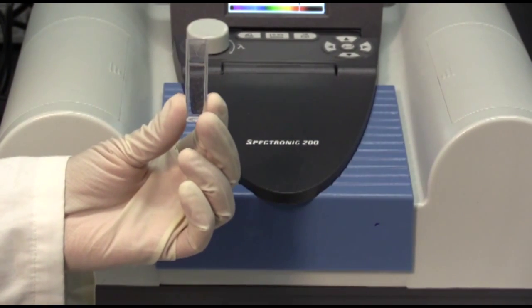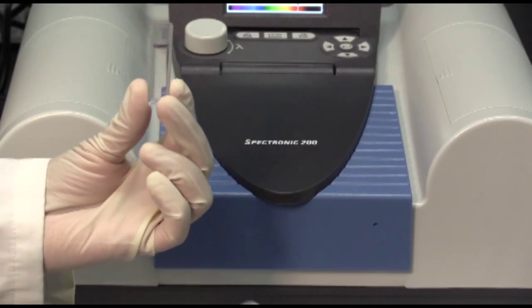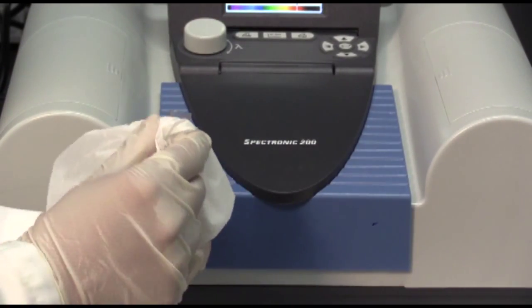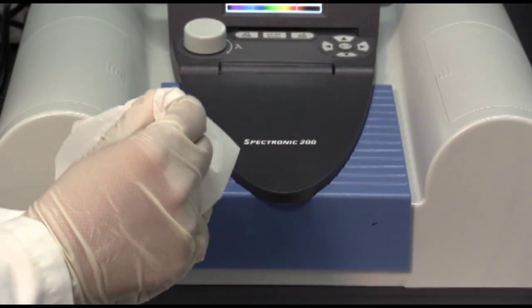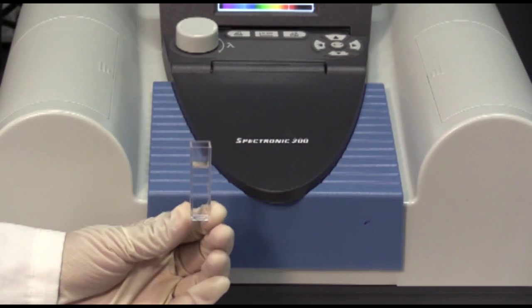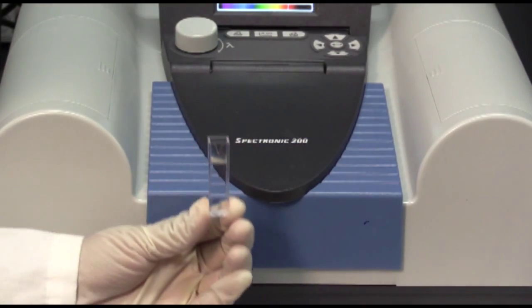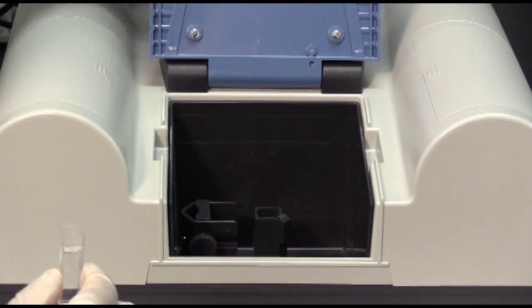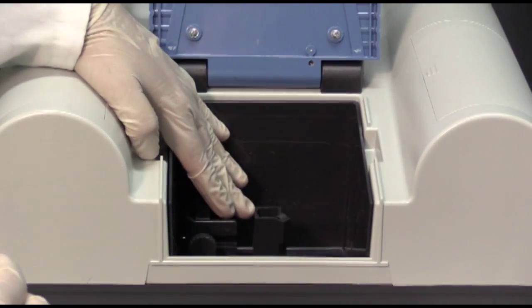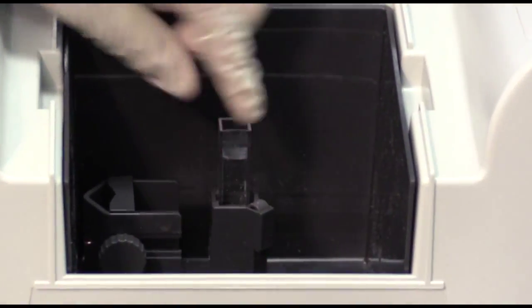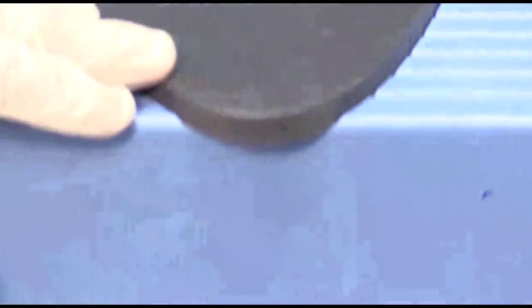Once you've understood which way is the clear sides, take a chem wipe and just wipe down the outsides to make sure there's no dust obstructing the clear windows of your cuvette, or this will affect your results. Once you are ready to put the cuvette into your instrument, just open the compartment. There will be a square holder for your square cuvette. Press your cuvette all the way down, and close the compartment.